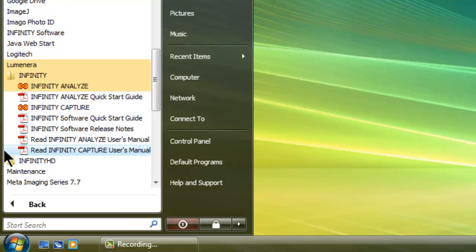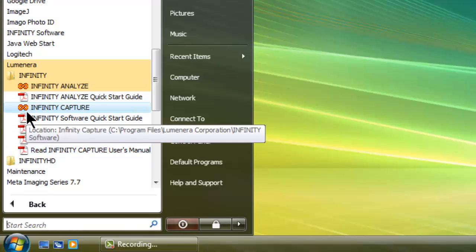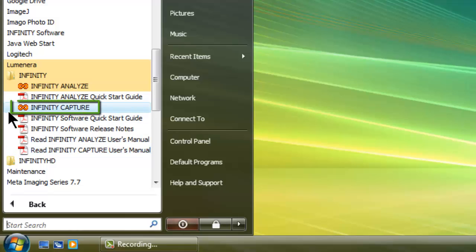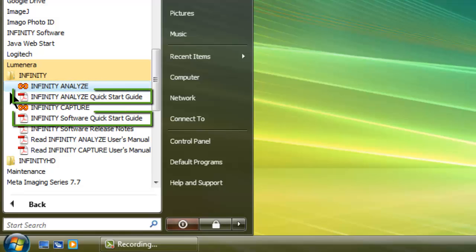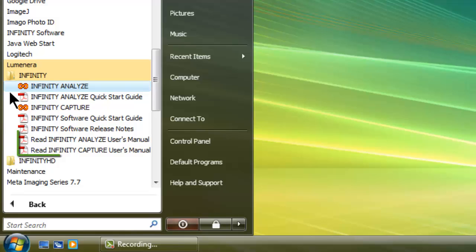The Infinity package includes Infinity Capture and Infinity Analyze. Infinity Capture is for simple image and video capturing. Infinity Analyze is for more advanced tasks, such as adding notes and measurements to images. Most new microscopy cameras work with Analyze. You can also find here quick start guides and user's manuals for both programs.